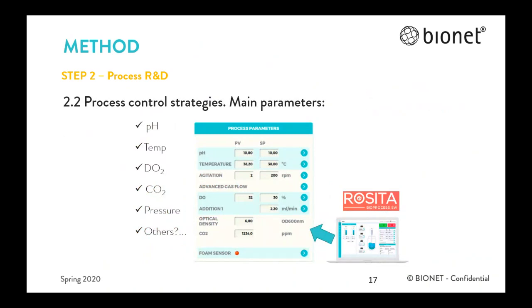Regarding the effects of process parameters on biological performance, they are critical. The main objective of bioreactor selection, design, and control is to provide the optimal environment for the biological reaction system. The bioreactor should provide optimal conditions, like temperature, pH control, oxygen transfer, mixing, and substrate concentration, in addition to its basic function of containment. Therefore, the process control strategies must be well defined, and then select in advance the sensors that will be necessary.